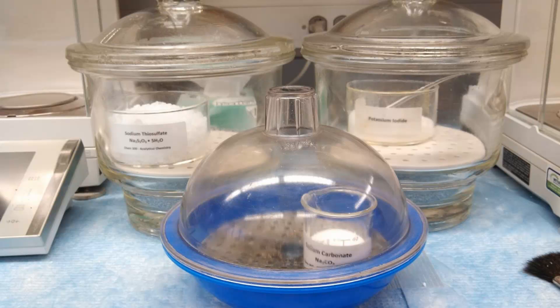In your procedure, it says that you're going to weigh out your sodium thiosulfate using a top-loading pan balance, and everything else using your analytical balance. We're not going to do that. We're going to weigh out everything on your analytical balance for this experiment. So when you come in, there will be three desiccators in the balance room. One is going to have sodium thiosulfate in it, one is going to have potassium iodide, and one will have sodium carbonate. There's going to be four sets of these three desiccators, so you'll have one relatively close to your balance.